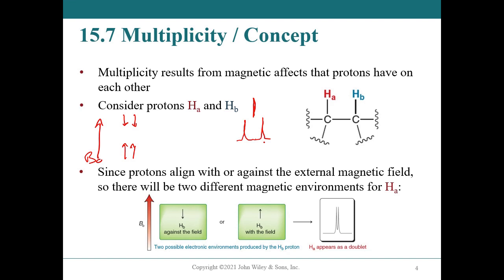And of course, when we do NMR spectroscopy, we're not analyzing a single molecule where we have just one A. We've got a whole bunch of them there. Depending on what you've put in, we're talking billions or trillions of them. And so half of those are going to have spin up for hydrogen B, half of them spin down. And so we're going to end up with 2 peaks of equal intensity. And that's what gives rise to our doublet.